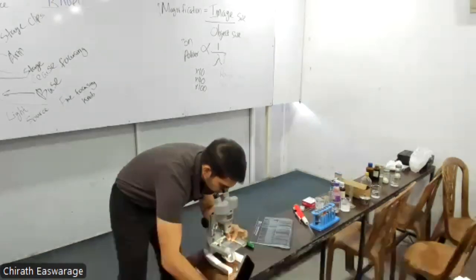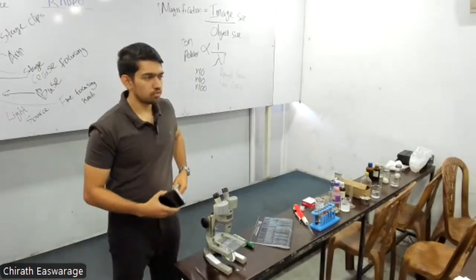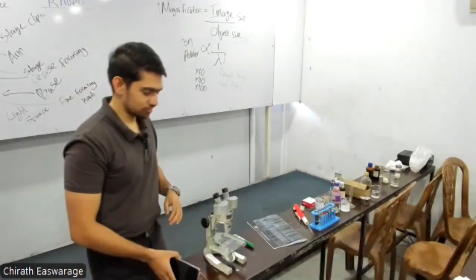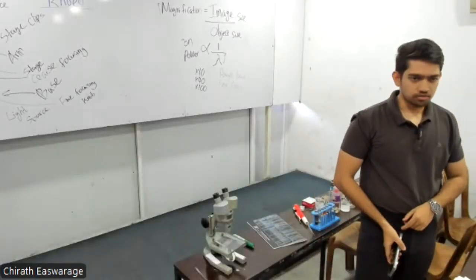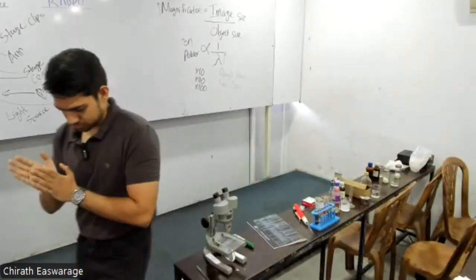The specimen has been a bit dried out, so the cells are dehydrated, right? Come one by one, let's try to prepare a new slide as well. So cells are a bit deep, very tightly packed.